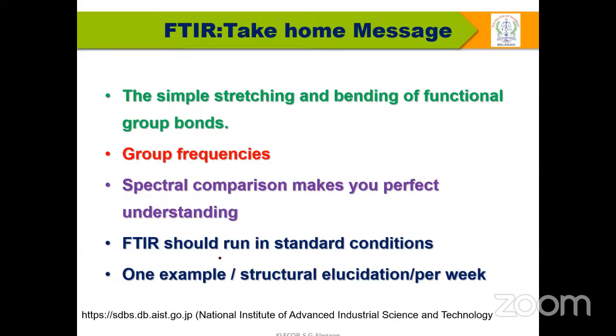FTIR should be run in a standard condition, or if your FTIR is not in a standard condition, there is a freely available site. If you note it down, there is a www.https, there is SDBS. This site is freely available. It is a Japanese site.